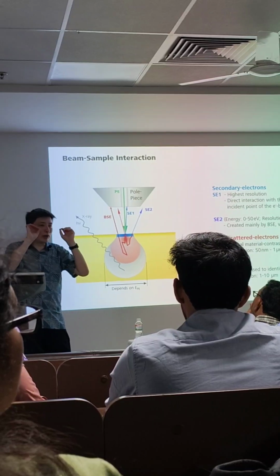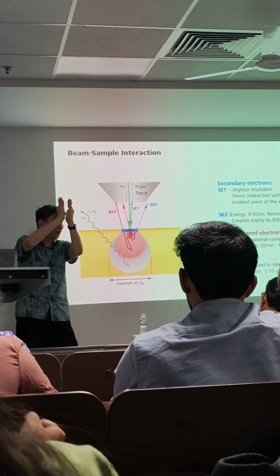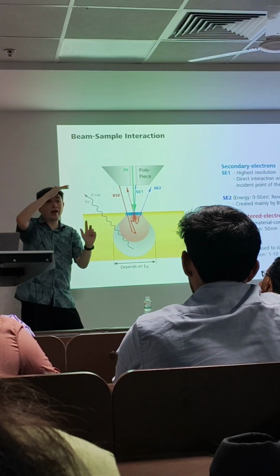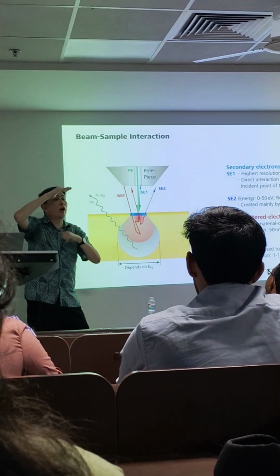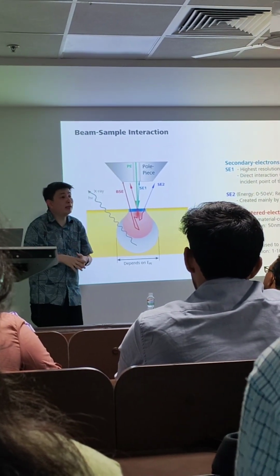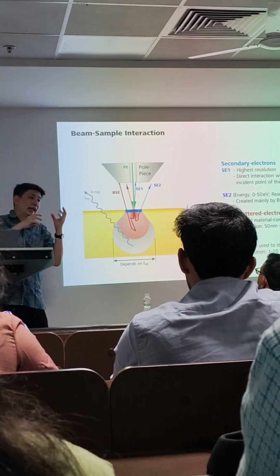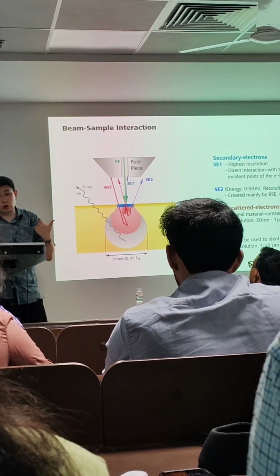So this detector is very good because you remember when I said the electron can accelerate back to the columns? When the electron go, it contains a secondary electron and backscatter. But we have energy filter. It's a negative plate, right? It will repel away the low energy ones. So what you see is really a real DSE information, backscatter electron. I will show you the detector later, right? So we have all these techniques to really capture what you want to know, what you need to know.